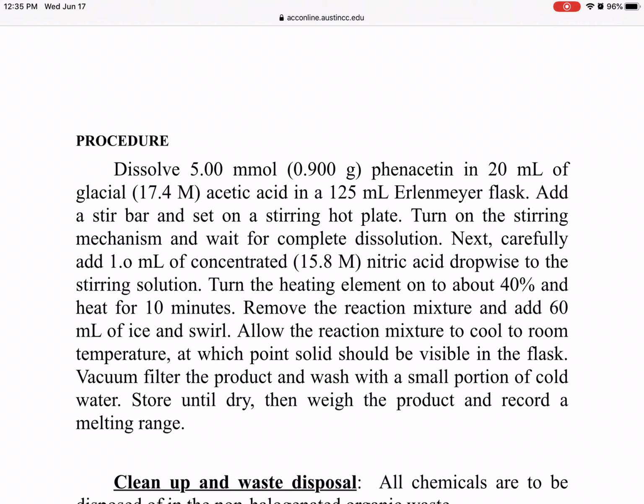And then remember, having water makes an organic compound crystallize out from the aqueous solution. Because we know like dissolves like, organic compounds will more readily dissolve in organic solvents. We have an organic product, hydrocarbon, and then we have water. They don't have intermolecular interactions similar that would keep it as a liquid. So then your product will form a crude solid.